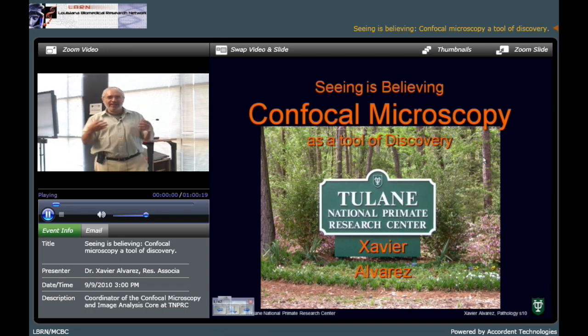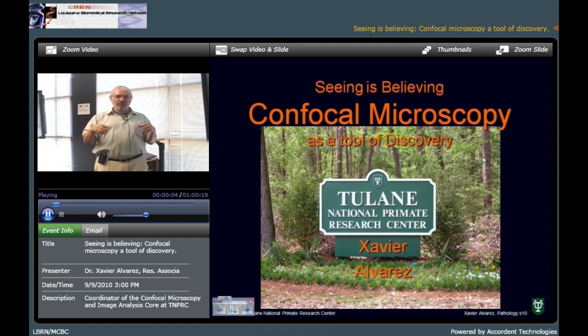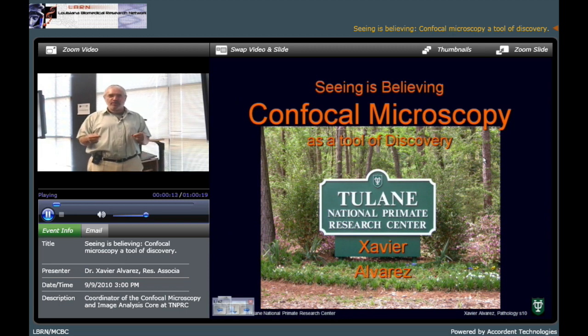To present. Yes, but essentially what I want to transmit to you is that anything that you could stain and you could see under fluorescent light, we could capture with a confocal microscope. Okay, anything, even if it goes like that. Okay.